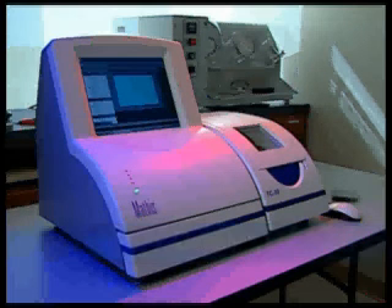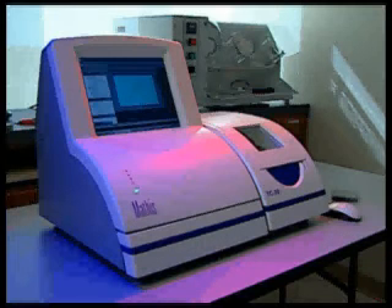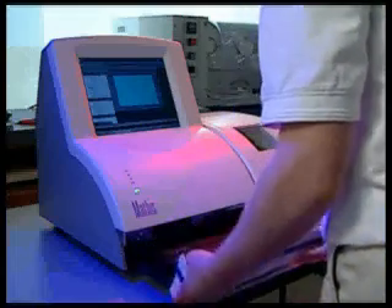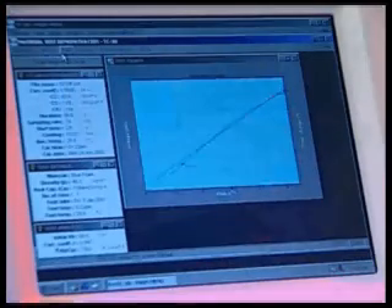The TC30 system is comprised of two components: the control unit and the sensor. The control unit is a networkable PC with LCD display, pull-out keyboard, and both CD and floppy drives. The control unit runs on the Windows 2000 operating system.